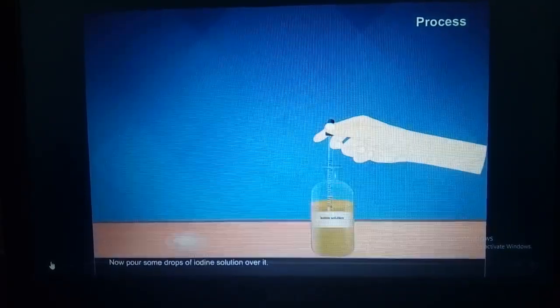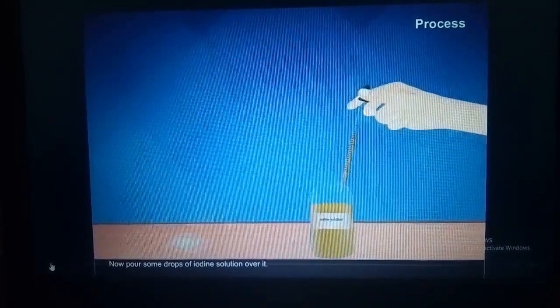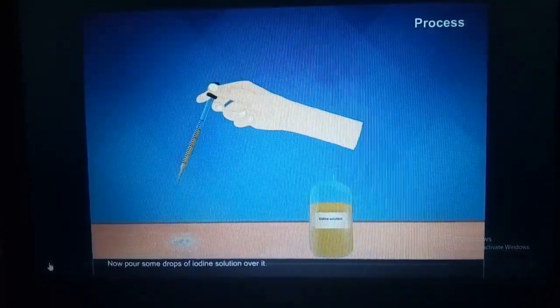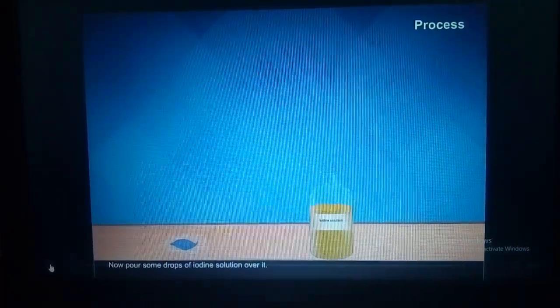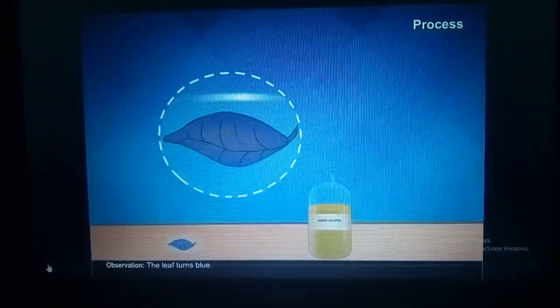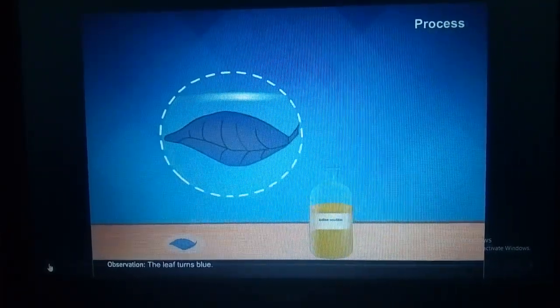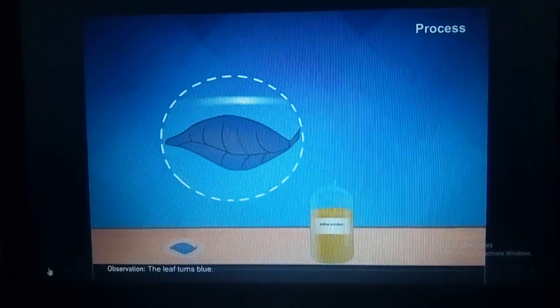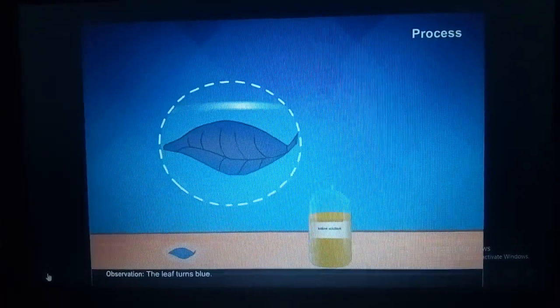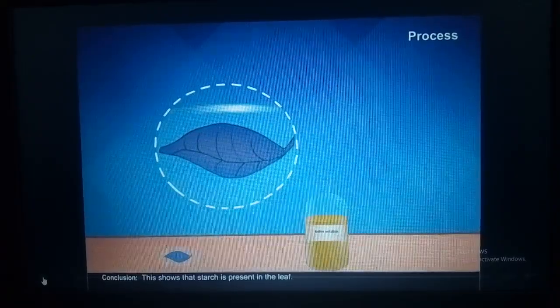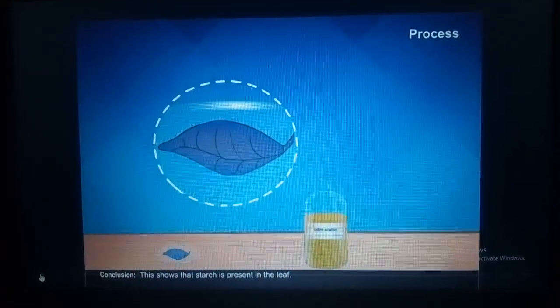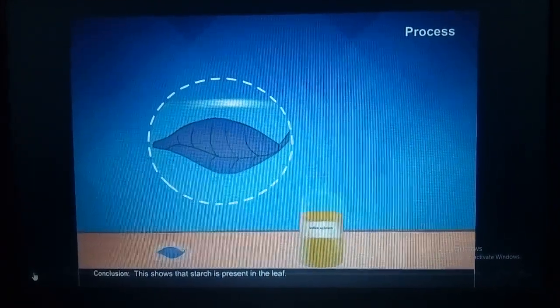Now pour some drops of iodine solution over it through a dropper. The color change observed shows that starch is present in the leaf.